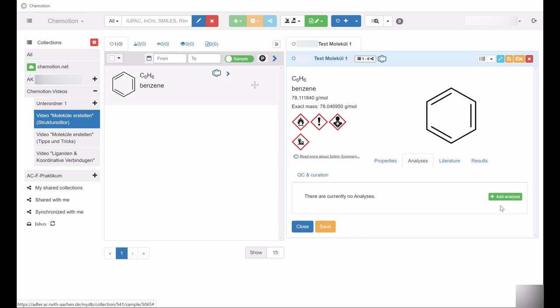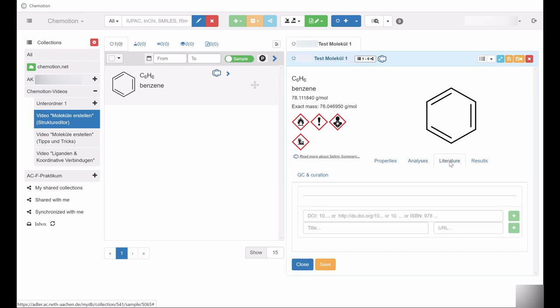If chemical compounds have already been published or are based on specific publications, the corresponding literature can be added as well. For example, the implementation of the DOI code can link the entry in Chemotion directly to the original literature source.